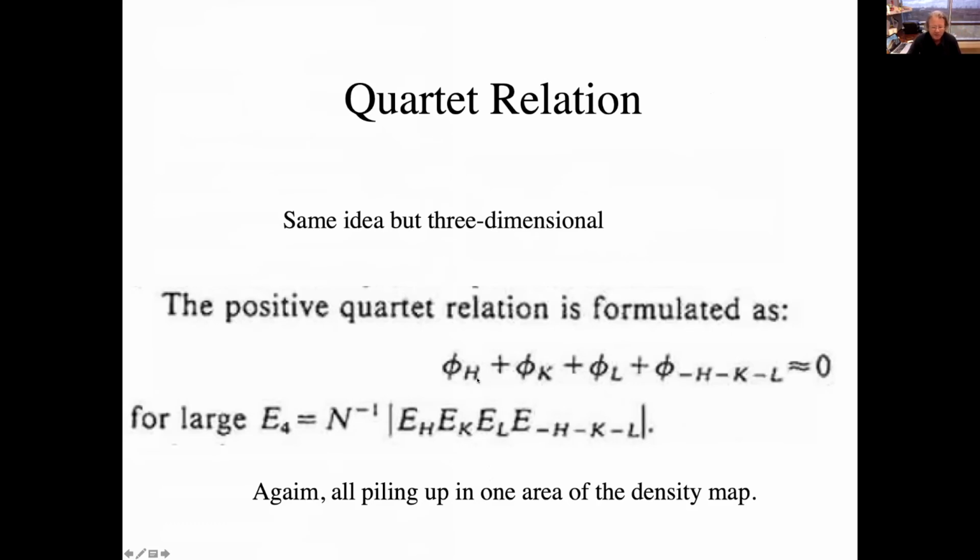So this has a relationship between the phase of the H, the phase of the K, and now a third one, a third integer triple. Now, don't confuse these with the integer HKLs defining a single lattice. This is an HKL, this is a different HKL, and this is a different HKL, but they happen to use the same letters. But these capital ones each refer to a distinct integer triple.